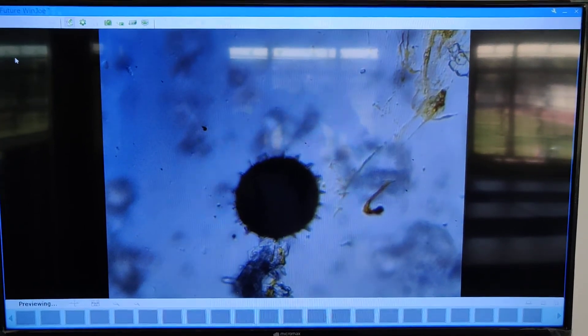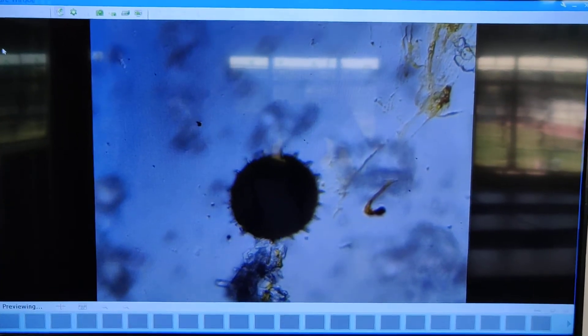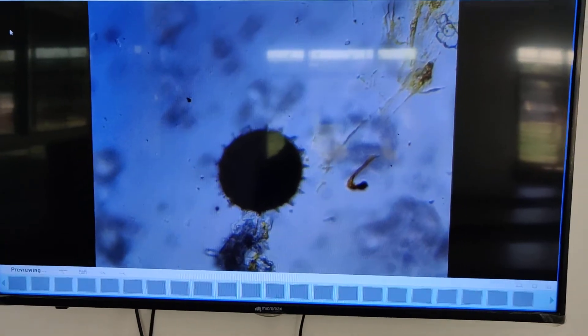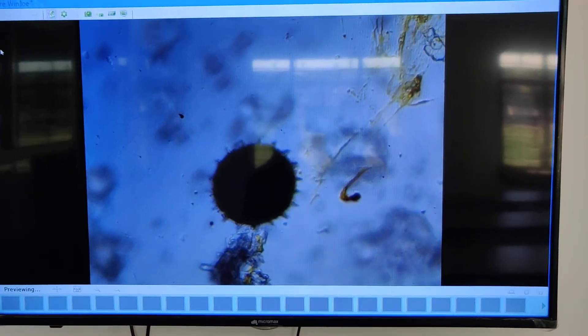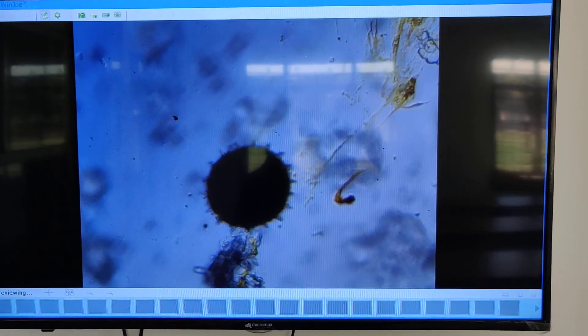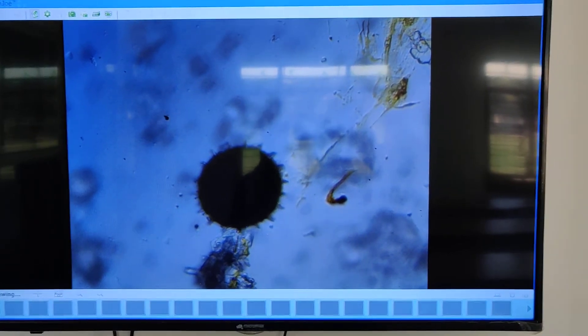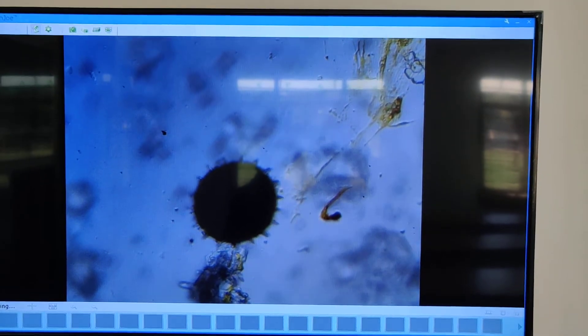So 5 minutes are over and now you can see the pollen grain under microscope on this screen. You can see in this pollen grain as well as in other pollen grains there is no germination. The exine is still intact. I will see it again after 5 minutes.